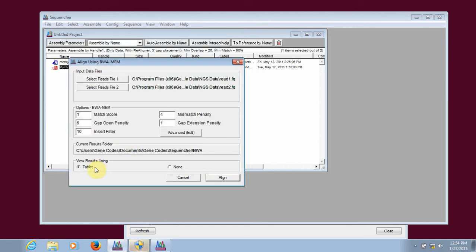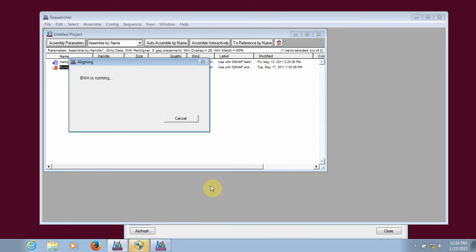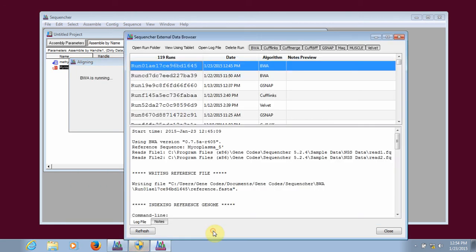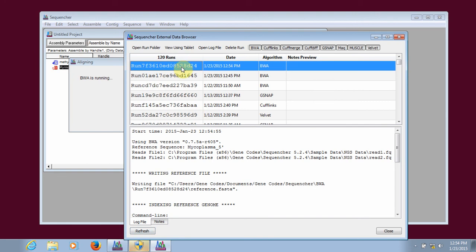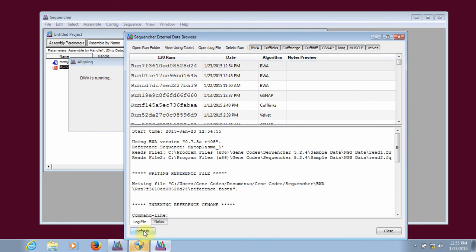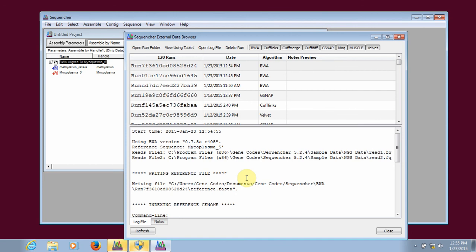You also have the option of automatically viewing the results in Tablet or not. Then you can click Align, and we refresh our external data browser. We can watch the progress of the alignment as it's going on.